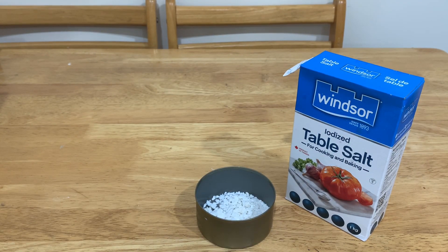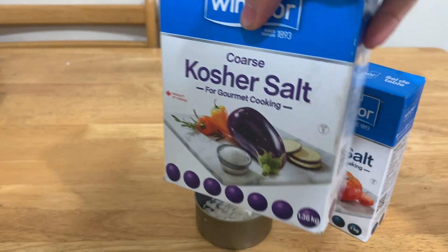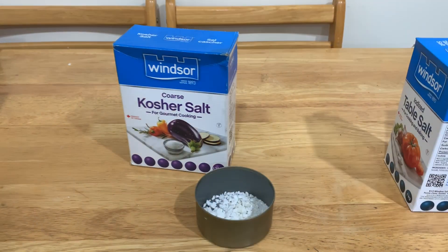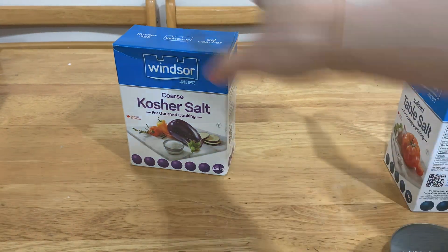Well, that was a complete lie. We can't use table salt, as most table salt is iodized or has some potassium salts mixed into it. Instead, I would recommend using pickling salt — it works much better for this process. In theory we can use iodized salt, just as long as there is no potassium in it, so there is no contamination in the result. Anyway, talking aside, let's actually get to this.